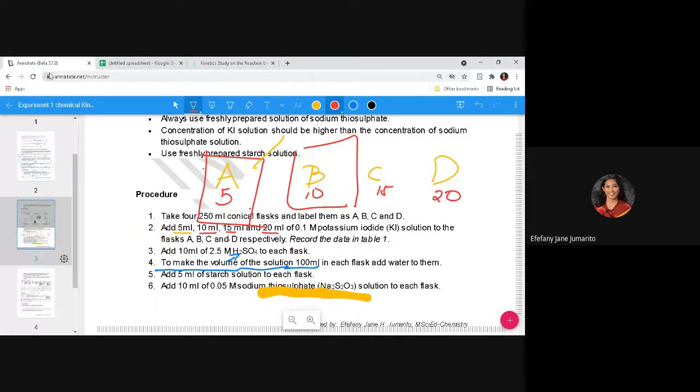Sige, we have Nieva. Okay, Tilos. Ay, ayan, Lisayaw. Lisayaw, test procedure 2.